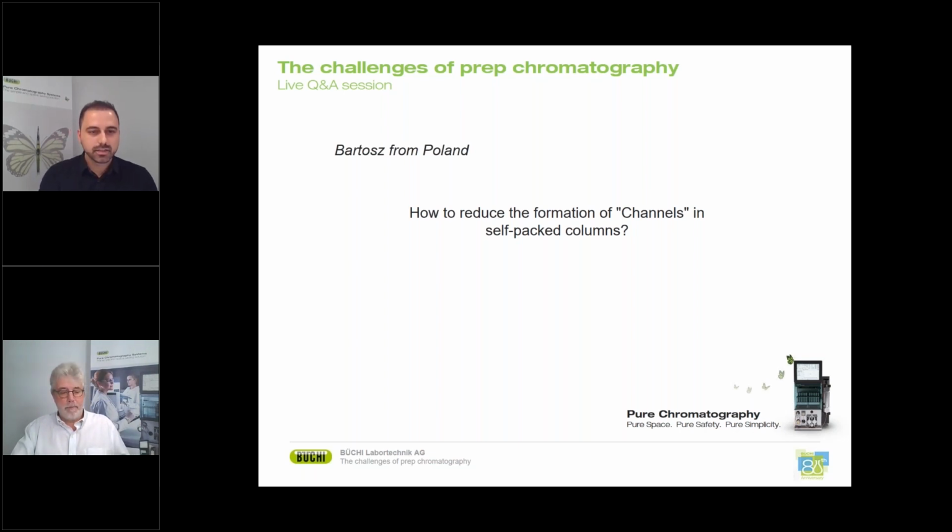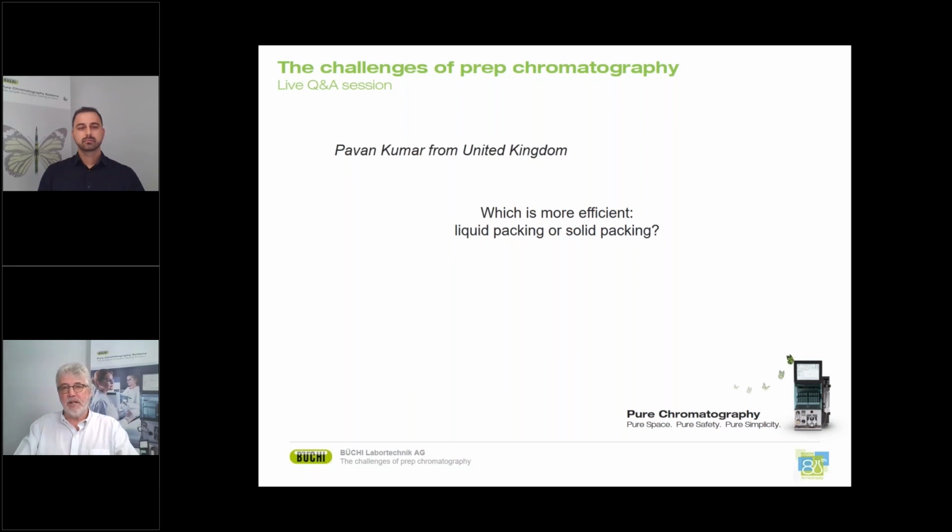Next question is from the UK, Pavan. Which is more efficient, liquid packing or solid packing? Well, I briefly mentioned already that if you use a liquid or a slurry better, so you are not able to dissolve, you just make a slurry to pack, that you typically will get much better results and much better efficiencies in your column than filling it as a dry powder.